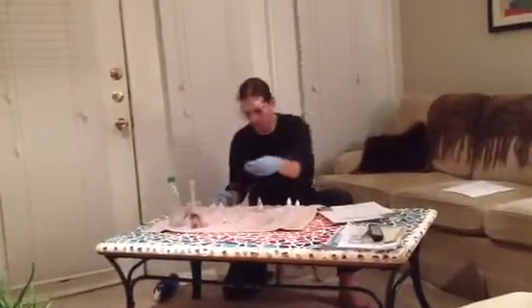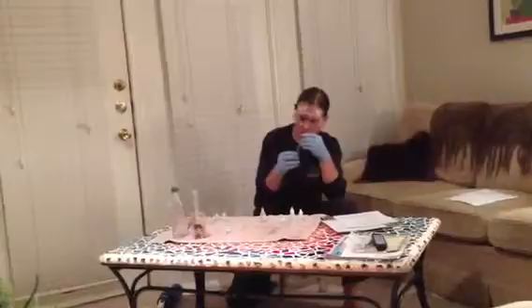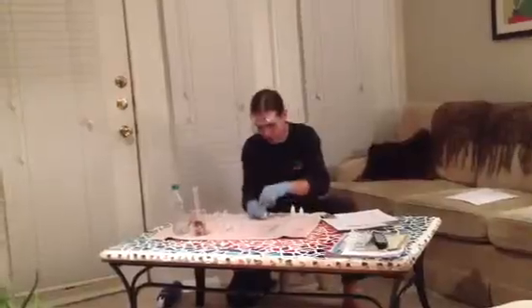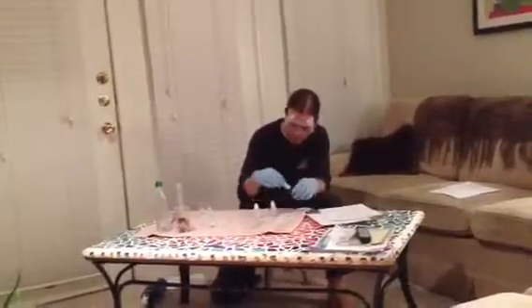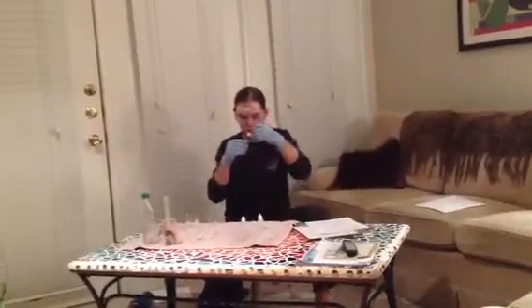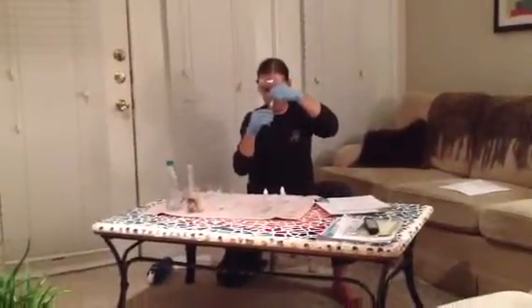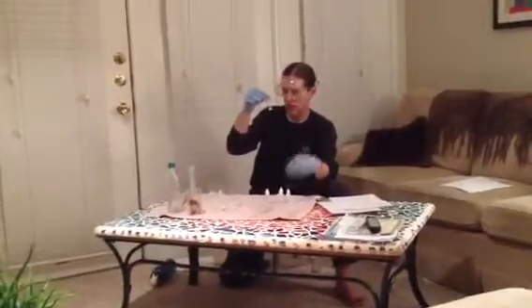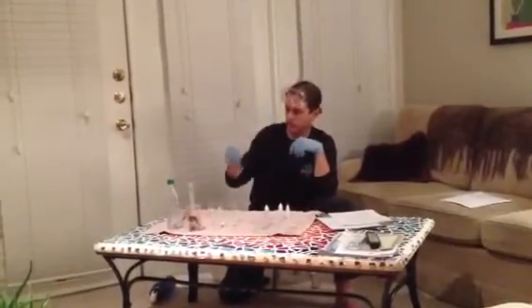All right, take bromide again. 8 drops. 1, 2, 3, 4, 5, 6, 7, 8. And I'm going to add this time silver nitrate. 1, 2, 3, 4, 5, 6, 7, 8. All right. Definitely getting a reaction here. I'm definitely seeing a precipitate.